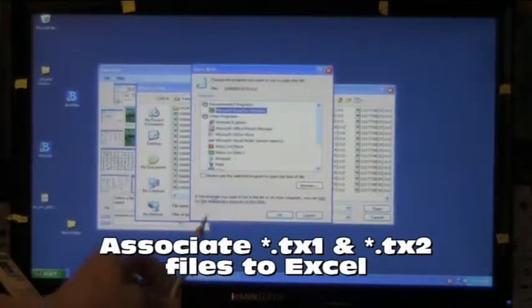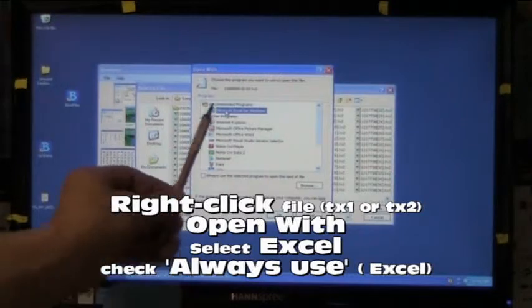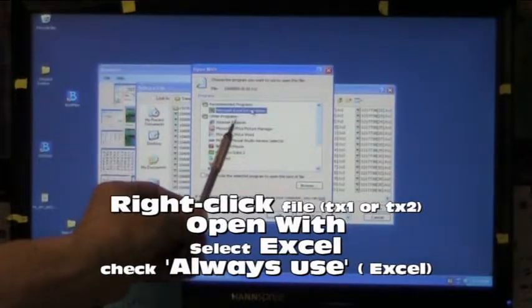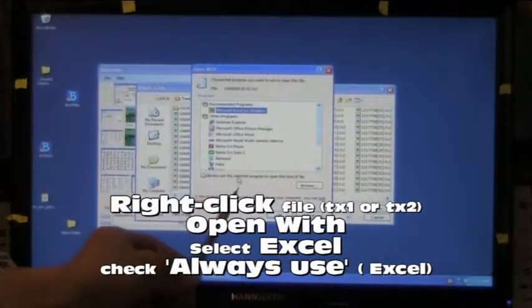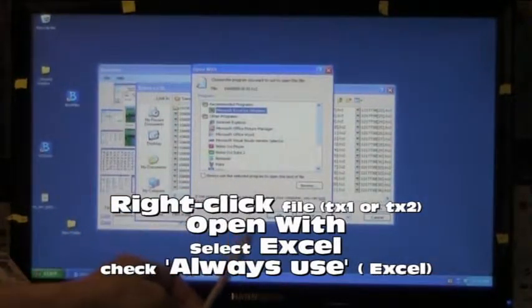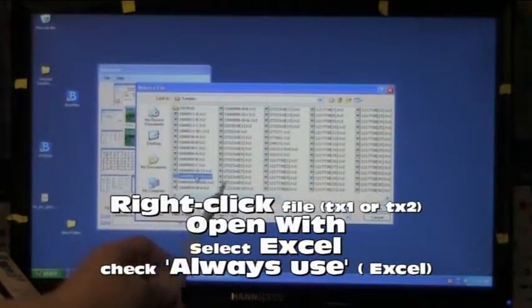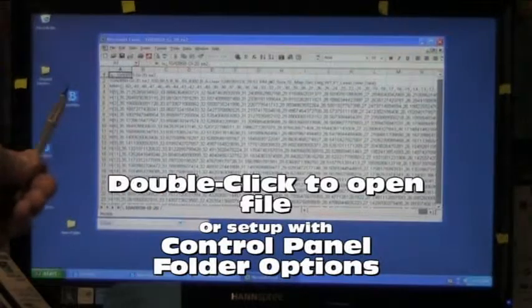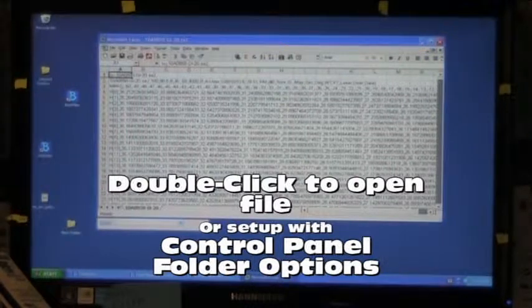Select a program to open the file, then select always use this program. I've already set this up. When it's set up, I double click the file and it opens.